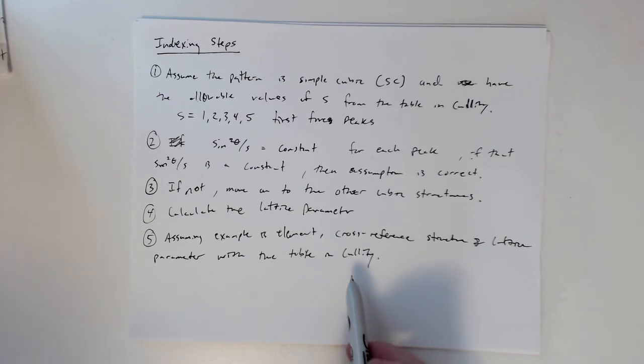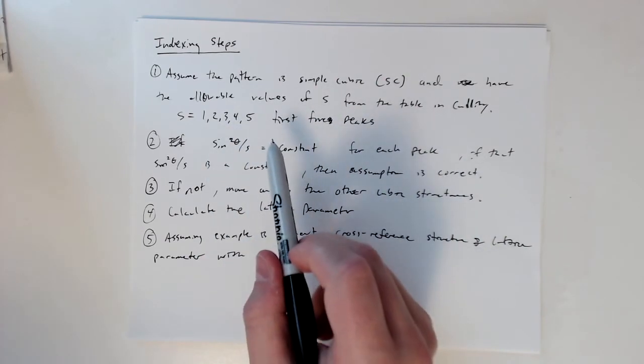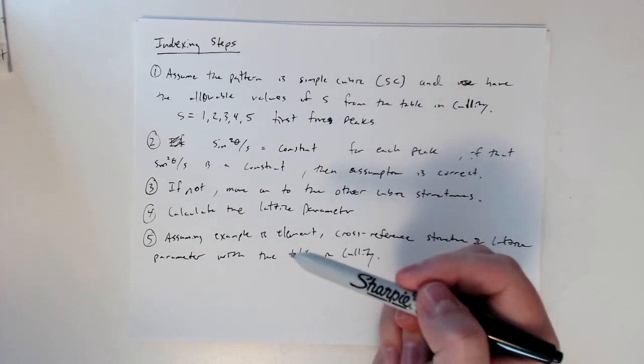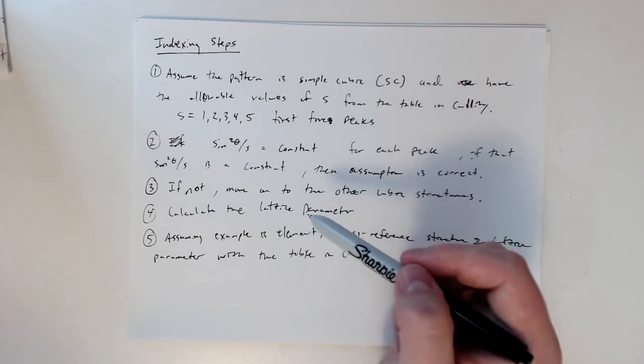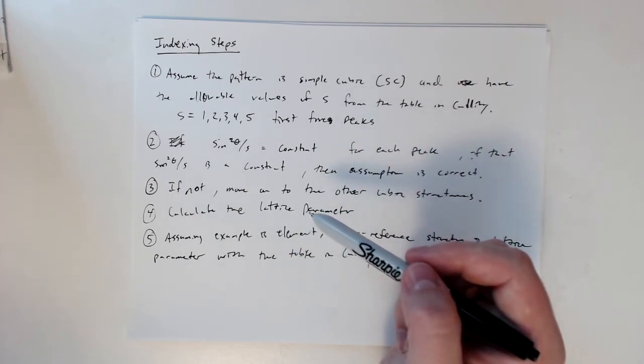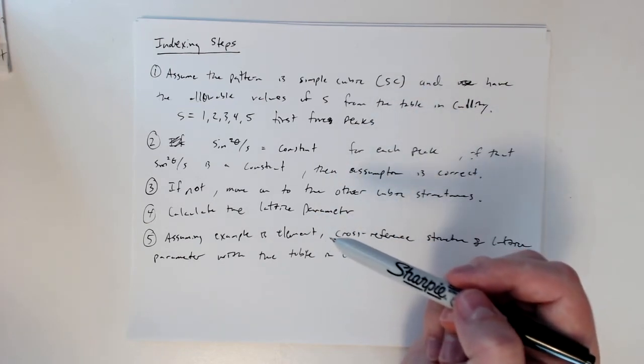So it's a very handy table. So we'll look at this in the last step. And then there's another table which gives you the S values. So as we go along and work this example, I'll show you those tables, and when you get to doing your own patterns, those will be made available in our folders.